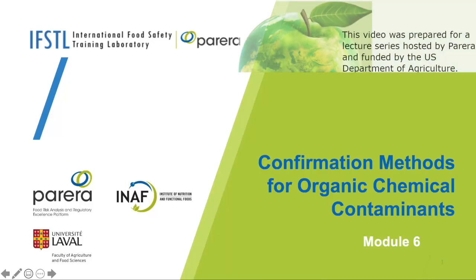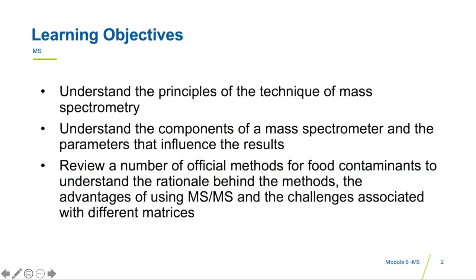Welcome to Module 6. Module 6 is dedicated to mass spectrometry as a detection technique following chromatographic separation either by gas or liquid chromatography.